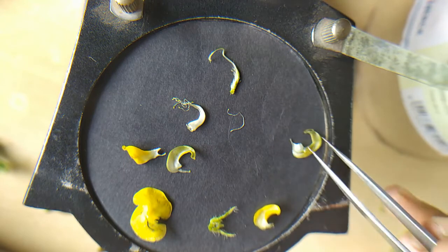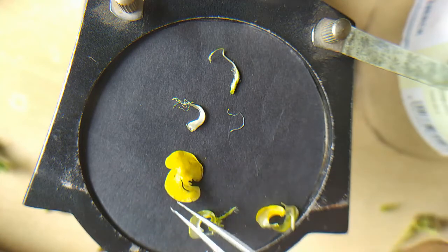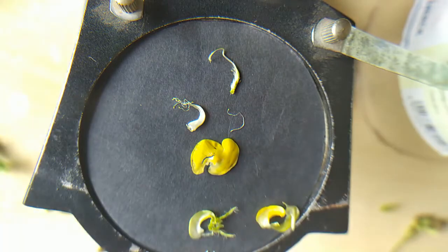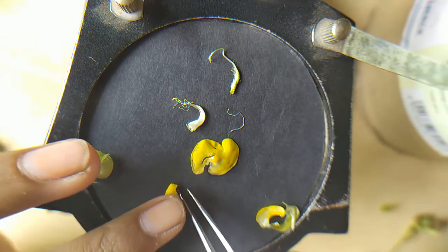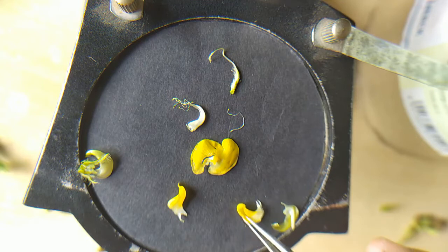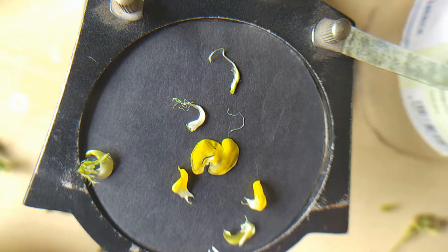After that, the standard will be there. After the standard, you should arrange the wings. After the wings, arrange the keels.